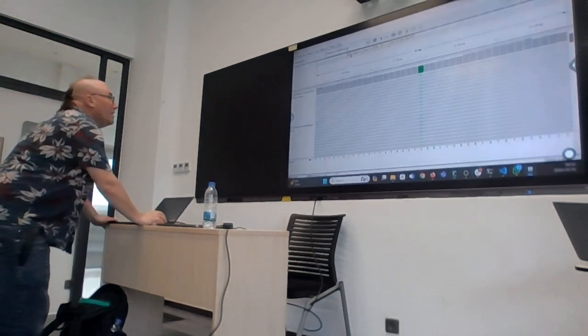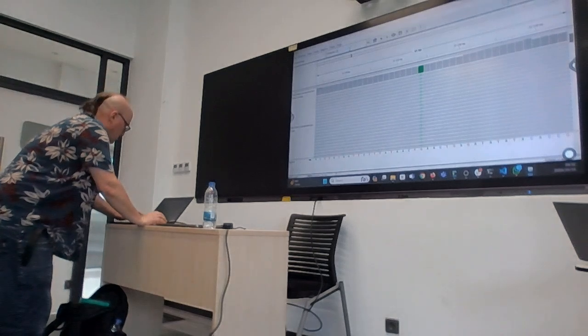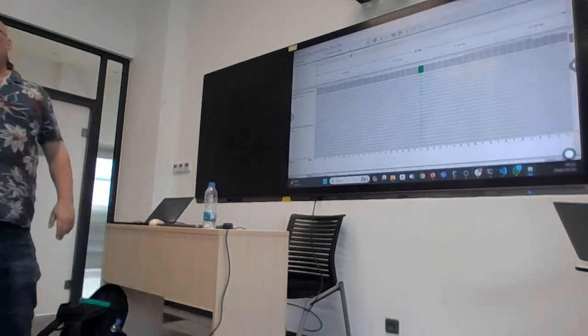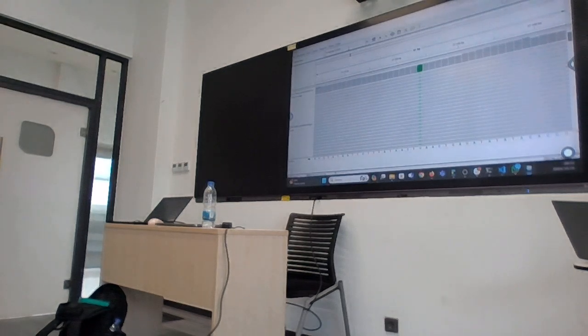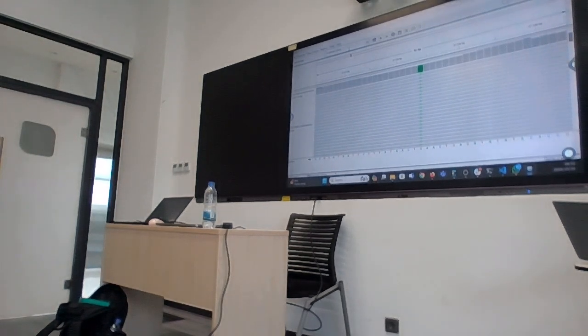I'll type this slowly. 37224. 37,000. Exactly. 37,000, 220. Okay, but can you go to 37224? And then you must see what I can see.